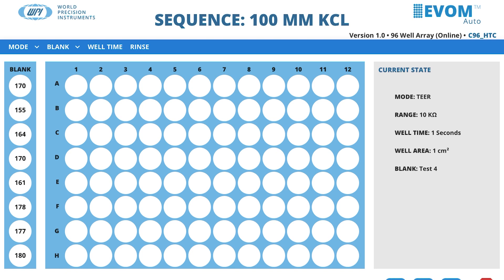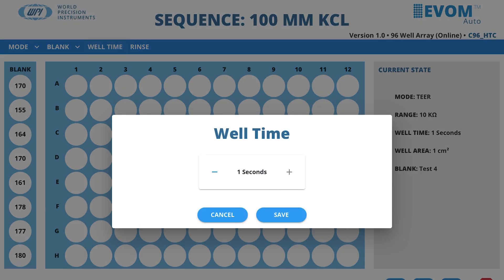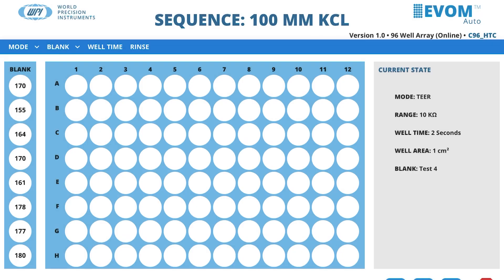Set up the well time by selecting the well time menu. The well time is the number of seconds the electrodes are immersed in each well when taking measurements. Enter the desired time in seconds and press save. The updated value displays in the current state area of the window.